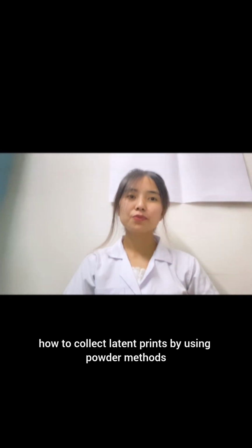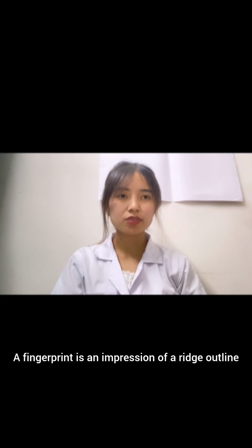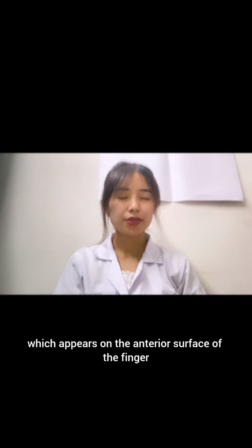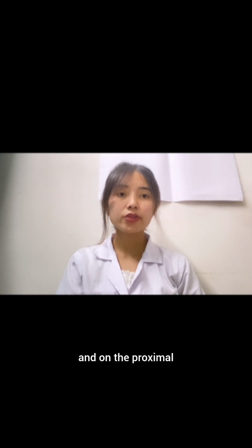Hello everyone, welcome to this video where I will show you how to collect latent prints by using the powder method. First, we will discuss what a fingerprint is. A fingerprint is an impression of ridge outline which appears on the anterior surface of the finger, on the proximal, middle, and distal phalanges of the finger, and on the proximal and distal phalanges of the thumb.